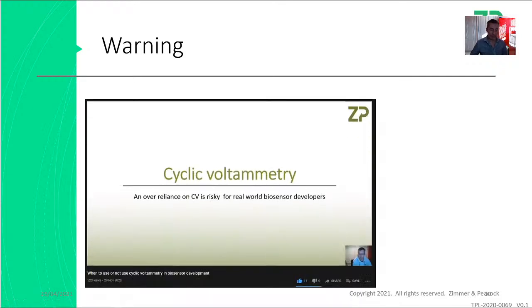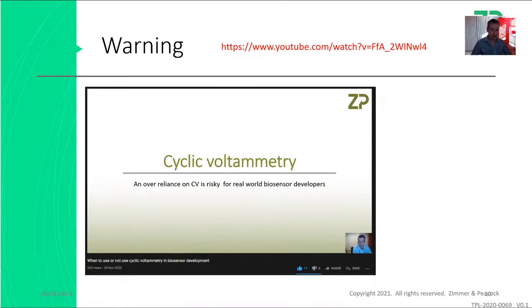This is a warning. This is a video that we have on YouTube, and essentially it's this: an over-reliance on cyclic voltammetry is risky for real-world biosensor developers. You do see cyclic voltammetry a lot in the literature, and we use it an awful lot as well at ZP. But if, let's say, your electrochemical glucose sensor is going to be using amperometry as its mode of operation, don't over-rely on cyclic voltammetry, because cyclic voltammetry has what they call the Faradaic signal, which is what we want.